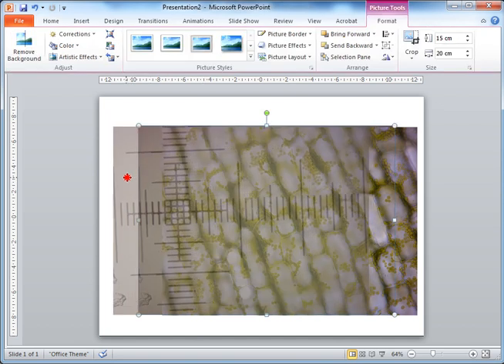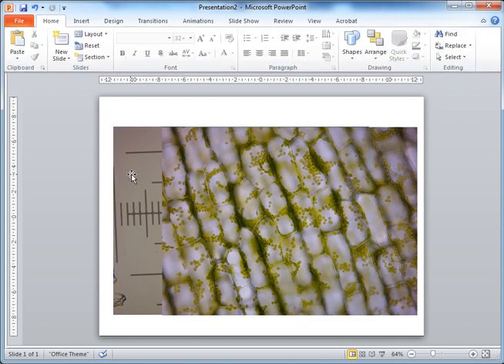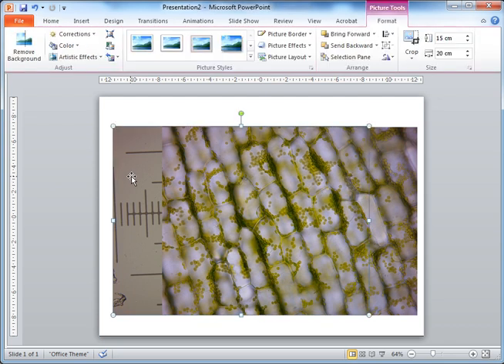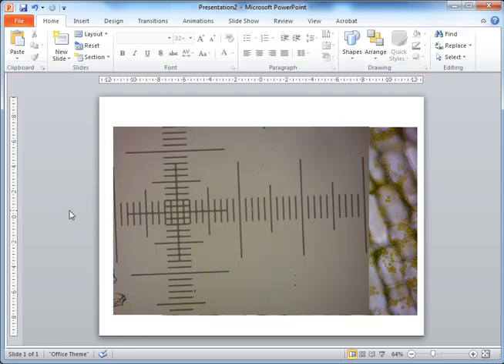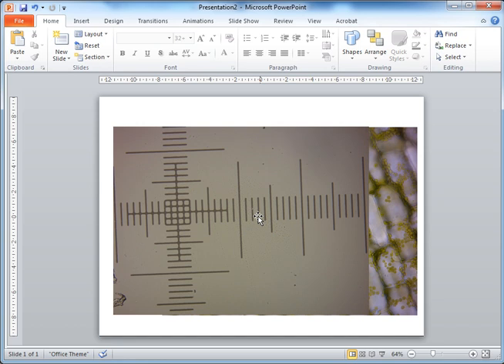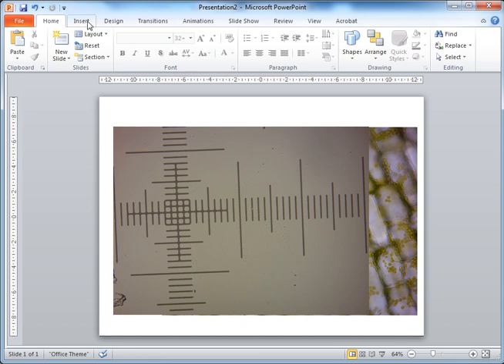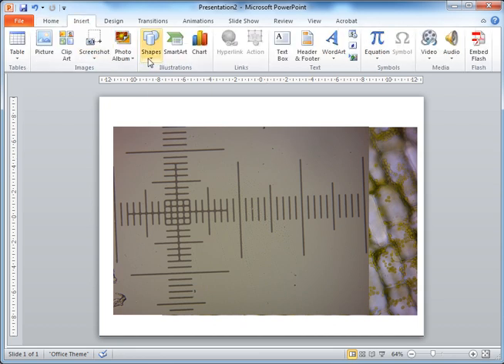This is the Egeria in the foreground, and if we drag that across we can see the calibration slide in the background. To bring the calibration slide to the foreground, click on it, right-click, and select the 'Bring to Front' option. Now we have the known measurements and need to determine the scale using them. I like to draw a line and determine how long it is in PowerPoint units between two reference points.